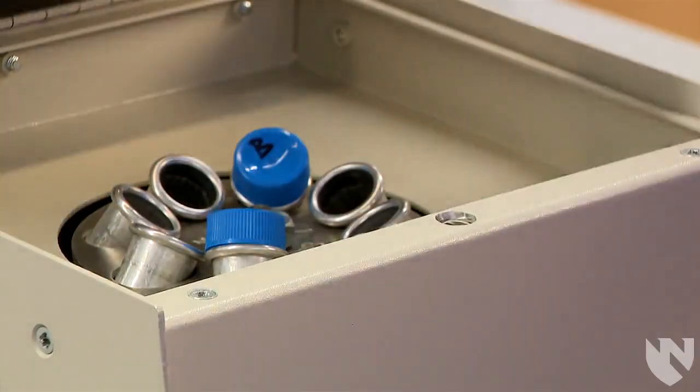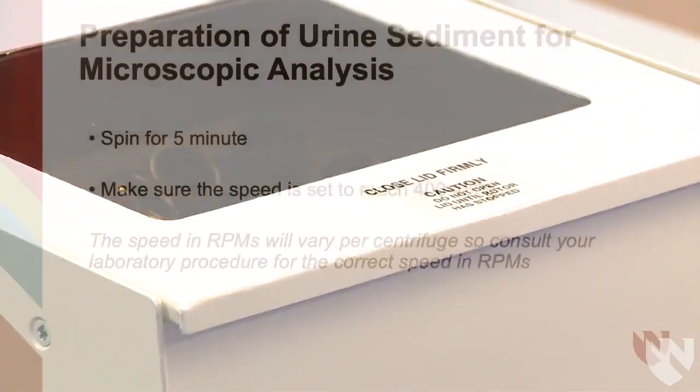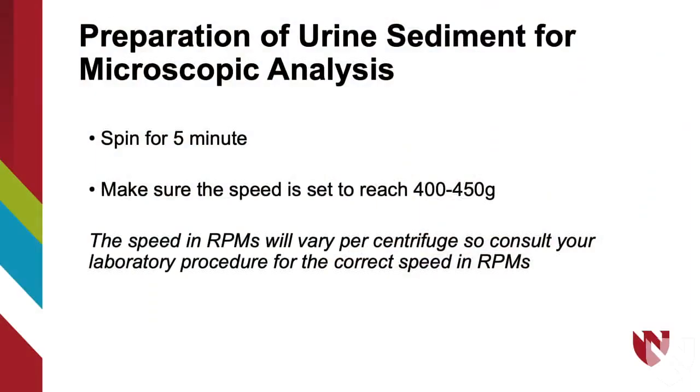Close the centrifuge lid and make sure the centrifuge is set to spin for 5 minutes and the speed is set to reach 400 to 450 g's. The speed in RPMs will vary per centrifuge, so consult your laboratory procedure for the correct speed in RPMs.